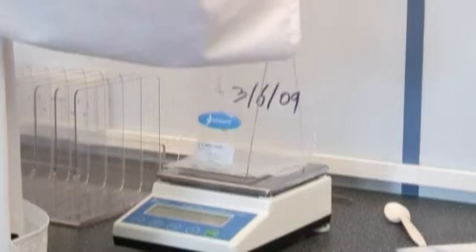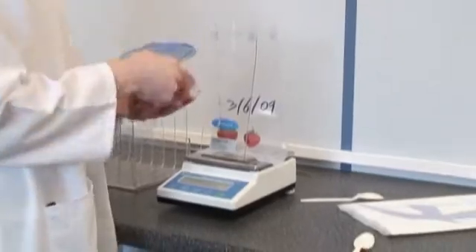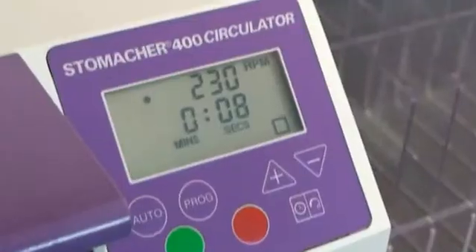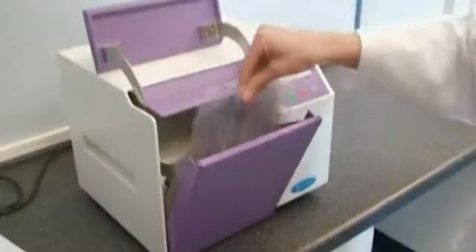The Stomacher 400 circulator and wide range of accessories is capable of processing a large variety of food samples for analysis, such as meat, seafood, vegetables, fruit, cheese and pastry. The patented circulator paddle design provides enhanced organism recovery with reduced debris production.